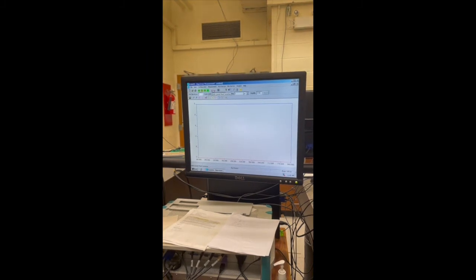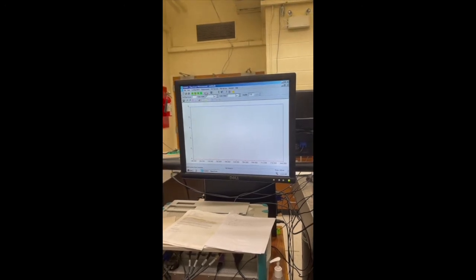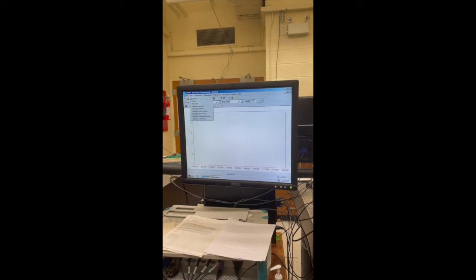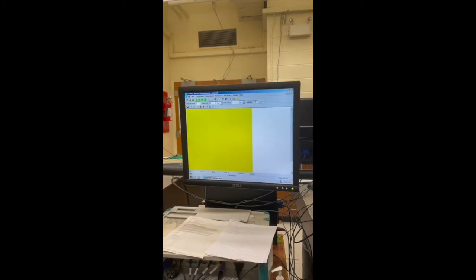But because you're just running it for the first time today, we're also going to want to run a steel calibration. So we're going to want to open up a picture measurement window as well. So go back to File, open another measurement window, but this time make it a picture. And that's going to look pretty different. We're going to need both of those views when we go ahead and try and take the data.